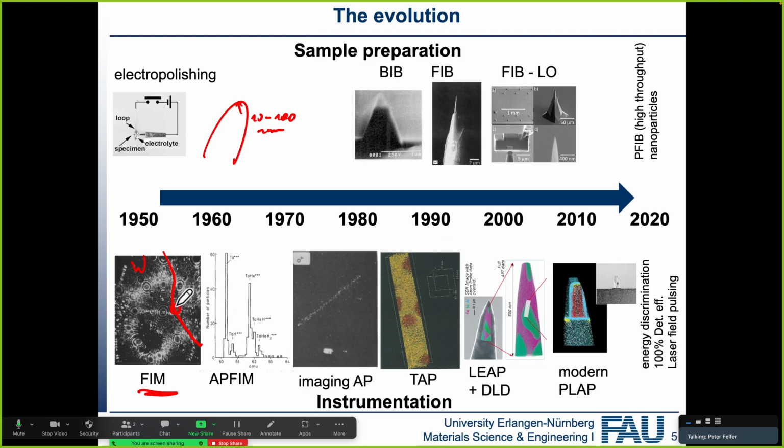But of course, if you only take a very small section of your specimen and you detect 1 ion every 100 pulses, and all of the atoms around it get lost in the detection system, of course you evaporate your specimen much faster than when you have a detector that covers the entire specimen and you detect 1 atom every 100 pulses. This is always something that's very important and people forget very often these days.